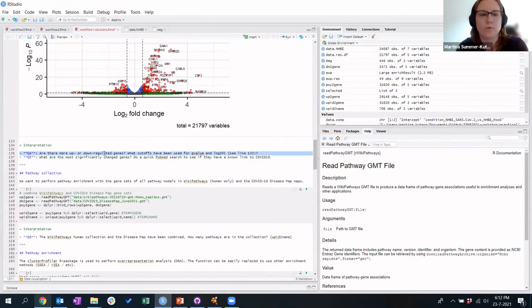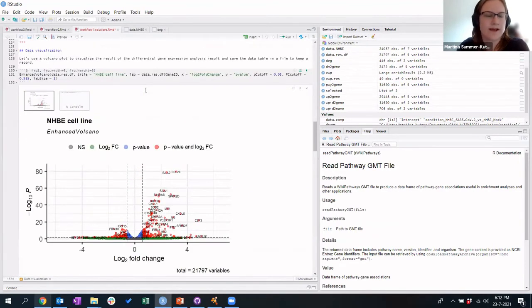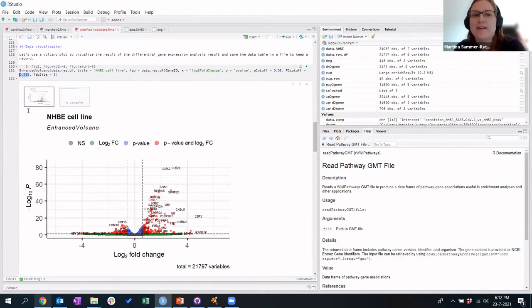In this case, I used a cutoff of a fold change of 1.5, so a log fold change of 0.585. So it needs to be at least 1.5 times as expressed, or half as expressed, compared to the non-COVID data. So it is like an absolute value of 0.585. Yes. So this is basically this line that we see here for the log2 fold change. Indeed. And for RNA-seq data, you might actually go lower. So you might just go for significance as a cutoff, or you do that cutoff. It really depends on the data that you have. For microarrays, you usually have some fold change cutoff to make sure you don't have too much noise included.